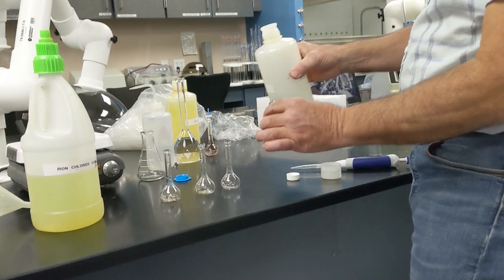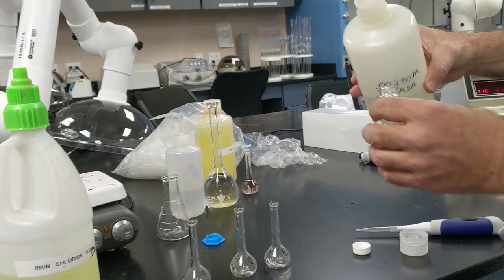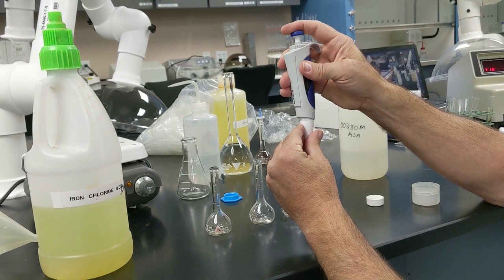So we're using 0.00280 molar ASA. You're going to need that value in a calculation. And so I'm going to put some into this clean vial. And then I'm going to pipette that into each of 3 volumetric flasks. So each of these volumetric flasks contain 25 mls.